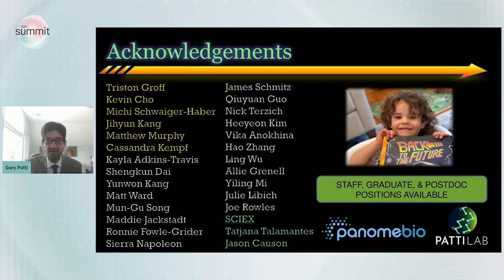Again, thanking Tristan. And I just want to say one closing thought, and that is that if someone said, what is the perfect MS/MS workflow for metabolomics? You might say, well, if I could get MS/MS data in 1 Dalton bins across the entire m/z range, that would be ideal. But as I've shown you, if you do that, 50% of your data are going to be chimeric. And that's going to be a problem because you can't deconvolute all that chimeric data. And so one could argue that you'd actually be better off doing sliding windows where you get lots of MS/MS data, but you have an opportunity to deconvolute it. And that's exactly what the ZT Scan is and what SCIEX has developed with this new instrument.